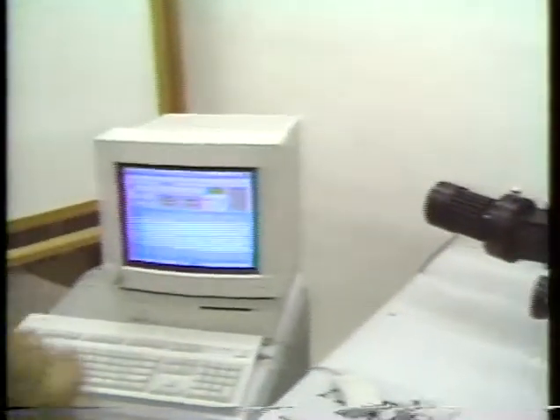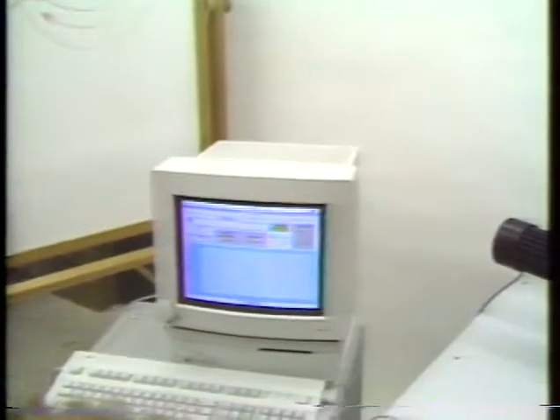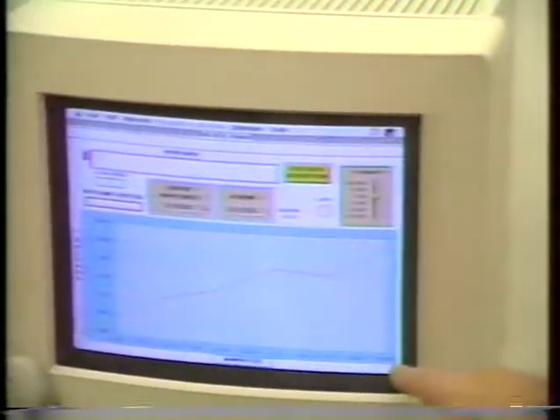We choose this particular interval to show that we can scan in intervals, but smaller intervals would take too much time. And we see the scan advancing here from 115, up to 125.